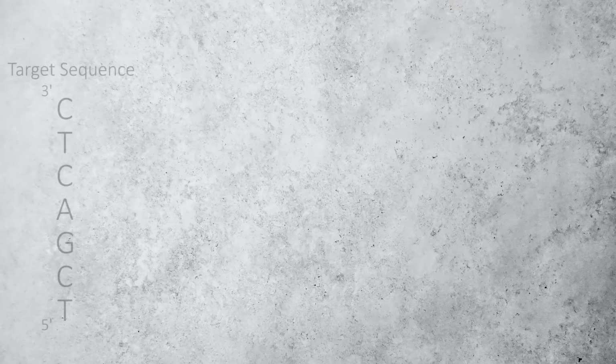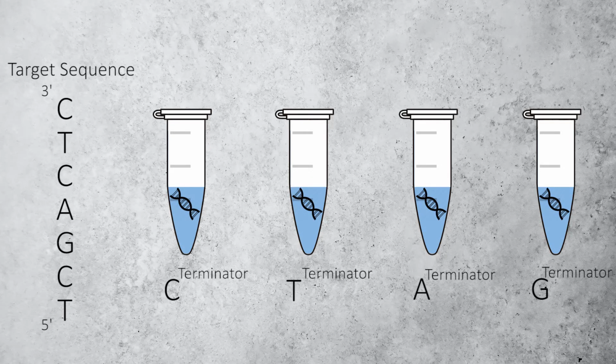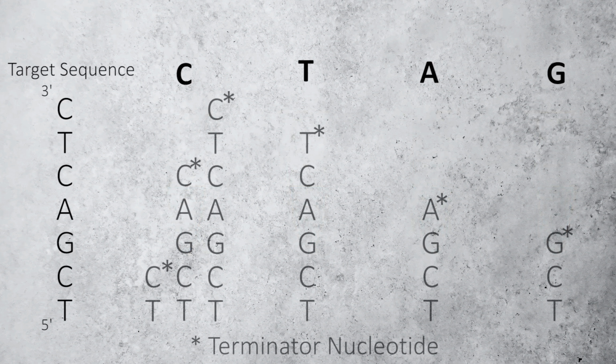Luckily, Sanger had an alternative solution. Similar to the Maxam-Gilbert method, the Sanger method would use fragmentation by polymerase reaction termination. This would also be performed in 4 individual tubes. In each tube, a dideoxynucleotide would be added for each of the 4 nucleotides, which acts as terminators that would halt the polymerase reaction. The resulting reaction of each tube would be various lengths of DNA fragments, all ending with the nucleotide of interest.